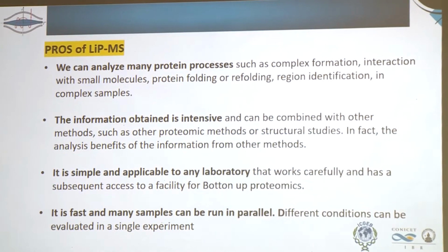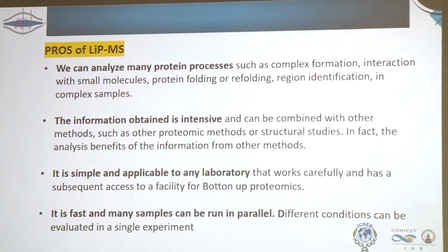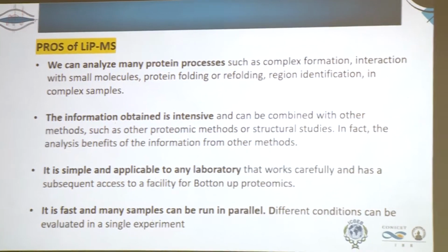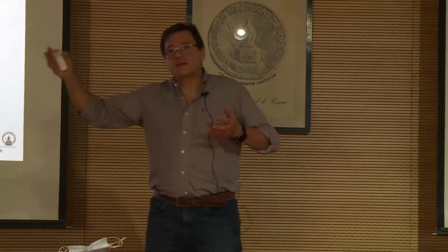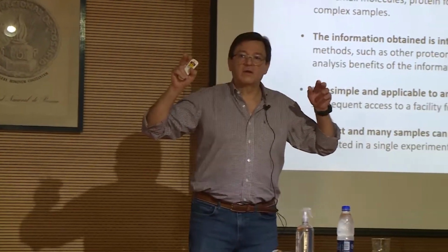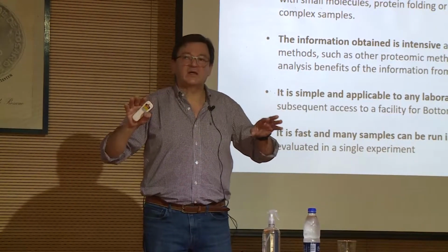Another thing, you have to check that the complexes you are seeing are physiologically relevant. If you have a protein that comes from a lysosome and it is binding to a protein in the cytoplasm, you have to take care that maybe this is not a good interaction.